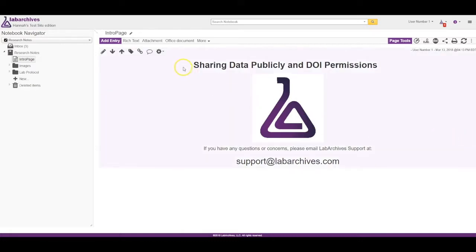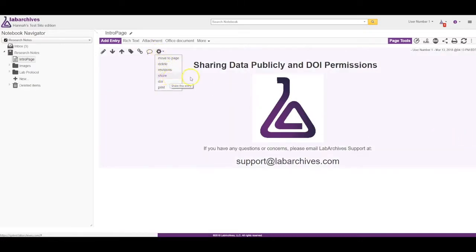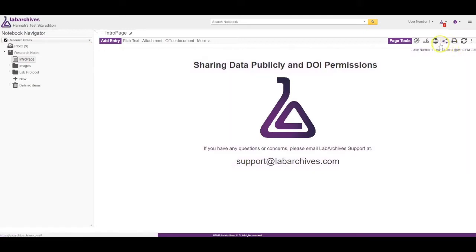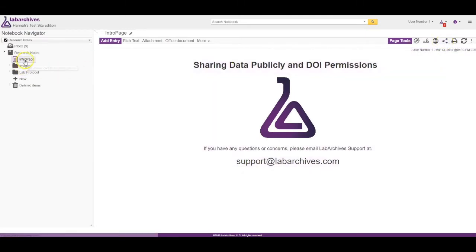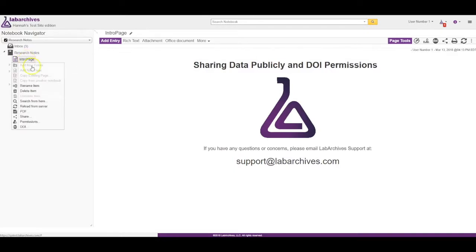You can share a single entry by clicking the gear icon and selecting share. You can share a page by selecting share in the page tools. Or you can share any item in the notebook navigator by right-clicking and selecting share.